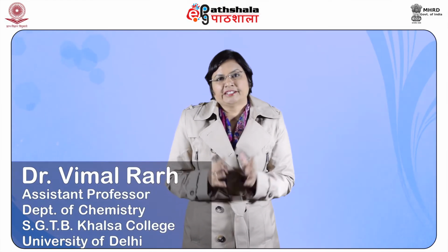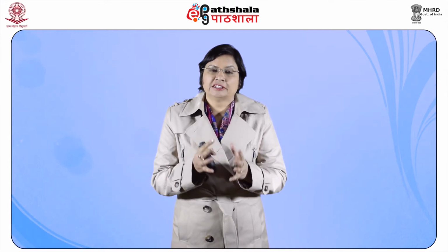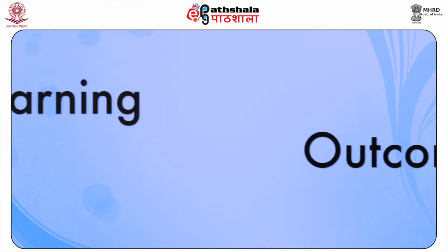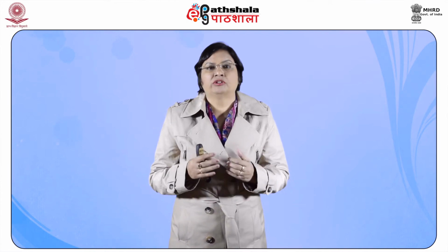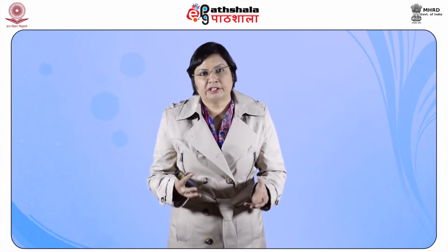Dear students, let us continue our study on organic spectroscopy, and in this module also we shall discuss some combined problems based on UV, IR, 1H NMR, 13C NMR and mass spectroscopy. After studying this module, you shall be able to learn how to derive the structure based on the information given in these different spectra. They can be UV spectra, 1H NMR spectra, 13C spectra, IR spectra and mass spectra.